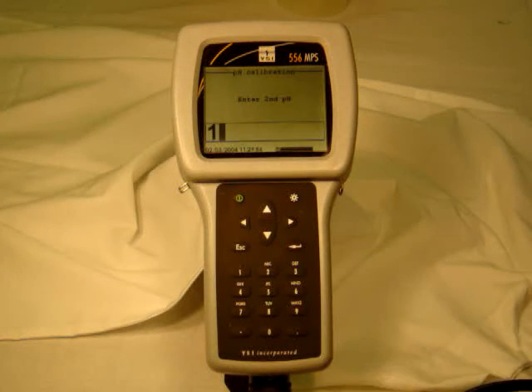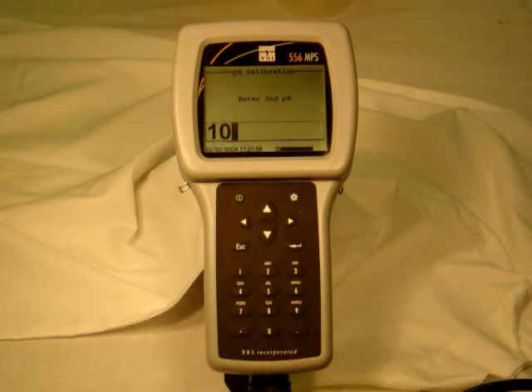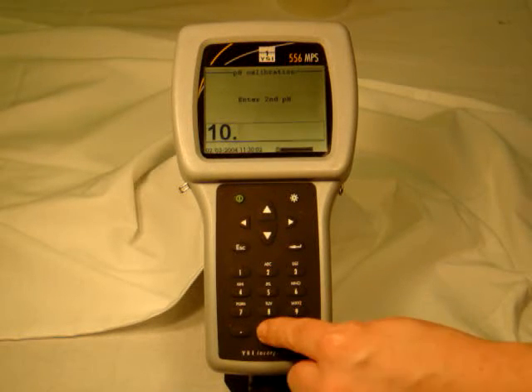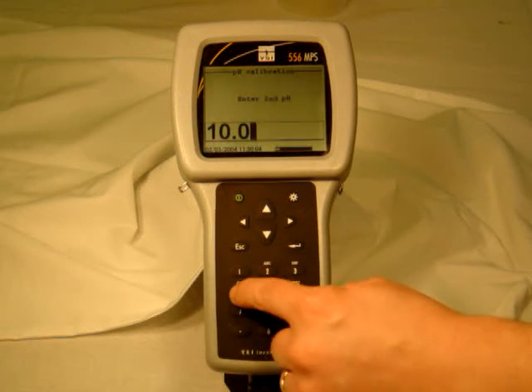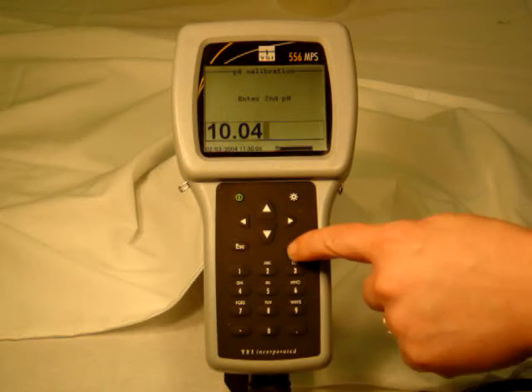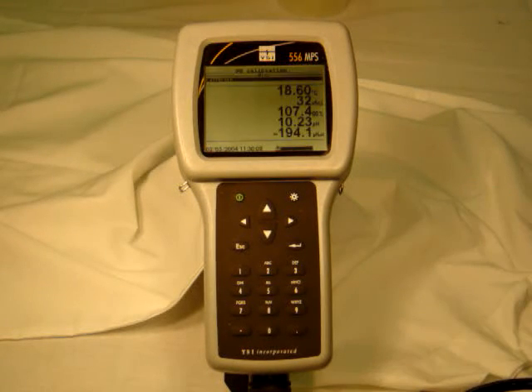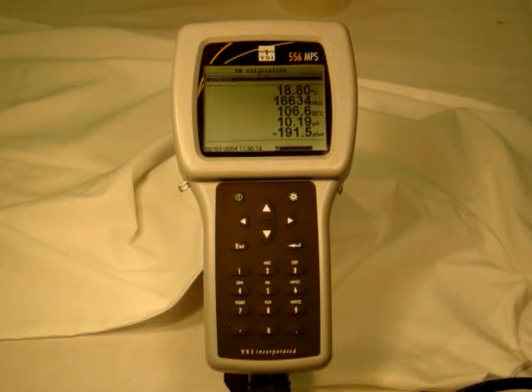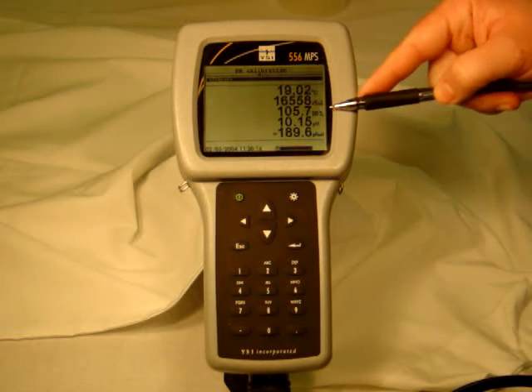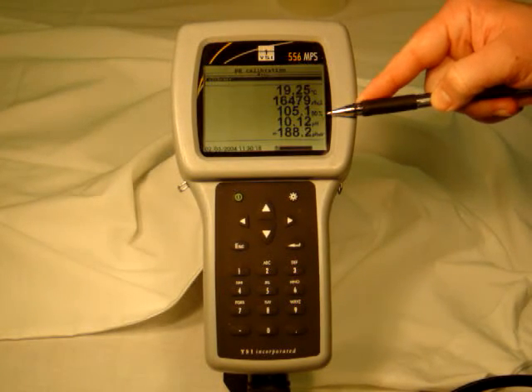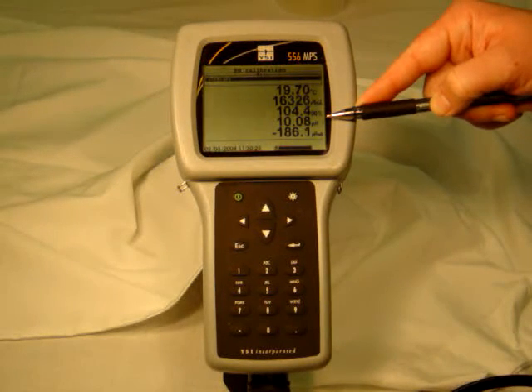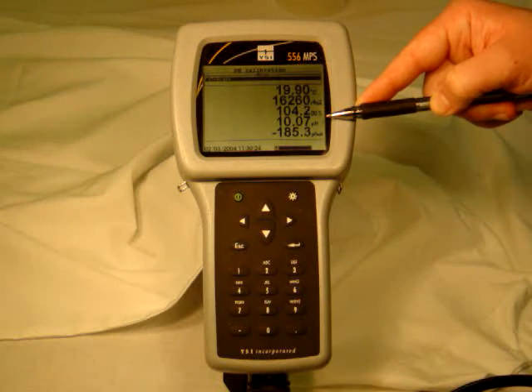One more, one more, yeah. You pan out? Yeah. Bit lower on the pan. Okay.